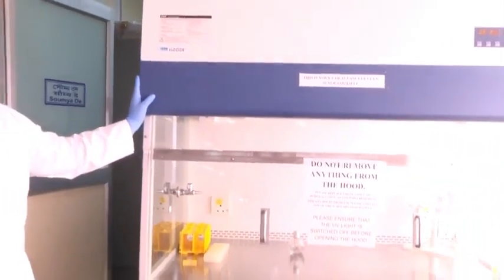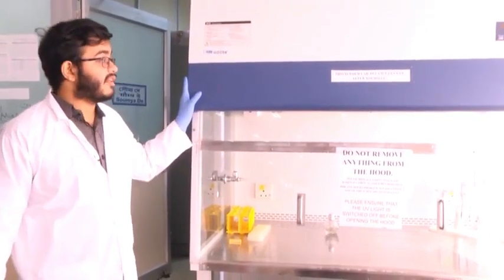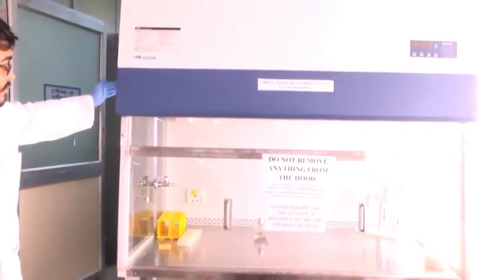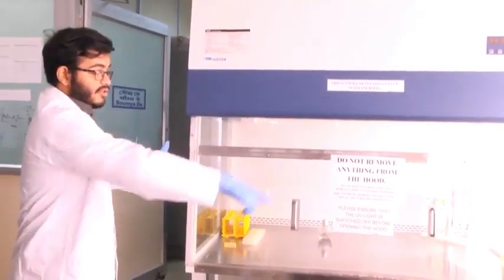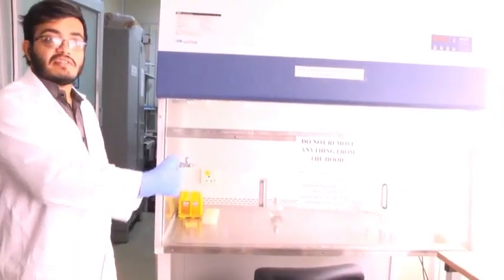So this instrument is a laminar airflow cabinet, and you will be looking at this instrument later on in further detail in the subsequent lectures. But in general, once you open this and it is switched on, there is an airflow filter and it maintains an airflow positive pressure which prevents outside air from entering this enclosed area, and this enclosed area is sterile. So there are UV lamps which sterilize the inner region when not in use, and also we keep spirit lamps and burners where we light them and we heat sterilize and alcohol sterilize this entire region.